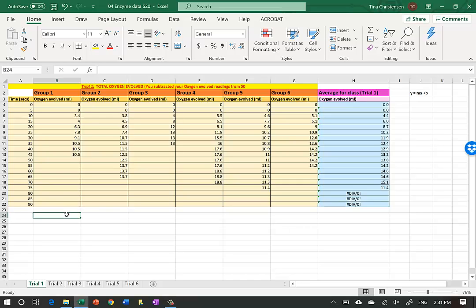I'm going to show you how you graph your Excel data or your enzyme lab data. Here is our file - we have various tabs that represent the various trials with different concentrations of substrate given to the enzyme. Let's start off making the first graph and graph Trial 1 data.